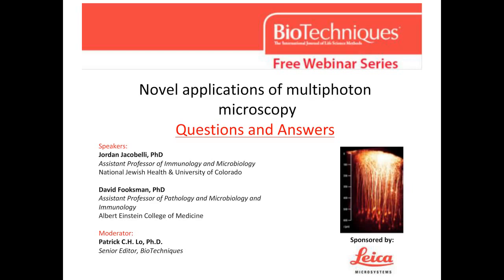Great. Then another general question is, can two-photon microscopy currently be used for drug screening related to toxicology? Do either of you know this? Yes, I think that's been used for certain instances. If you're looking at, for example, cell death or inhibiting tumor migration, there are examples of use of two-photon microscopy for that. Obviously, you probably need to do it more longitudinally over, potentially, days. So you need a very specific type of imaging technique.